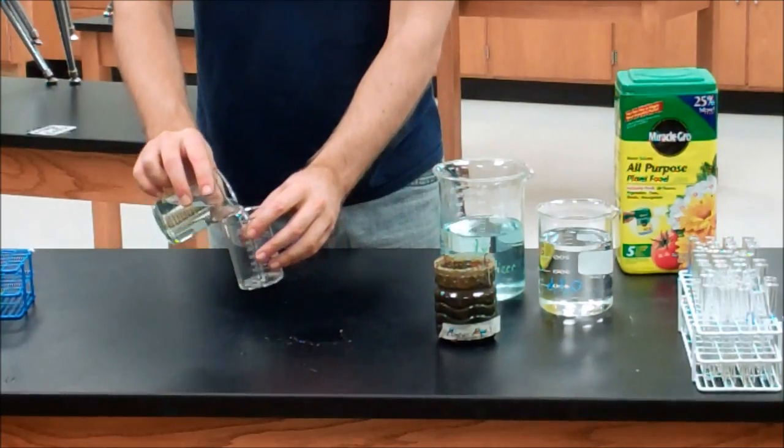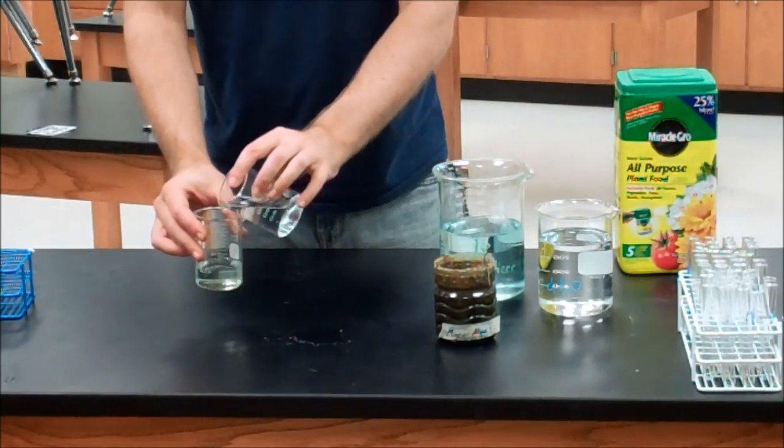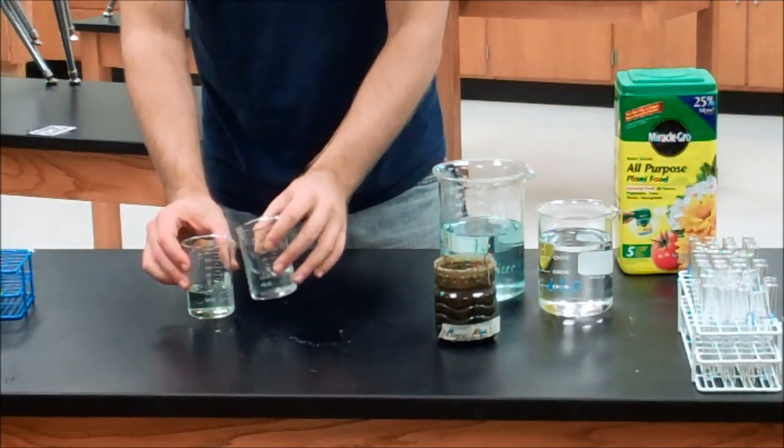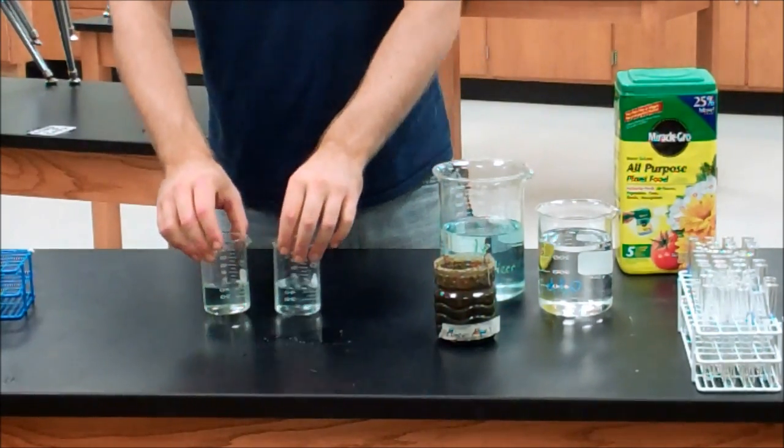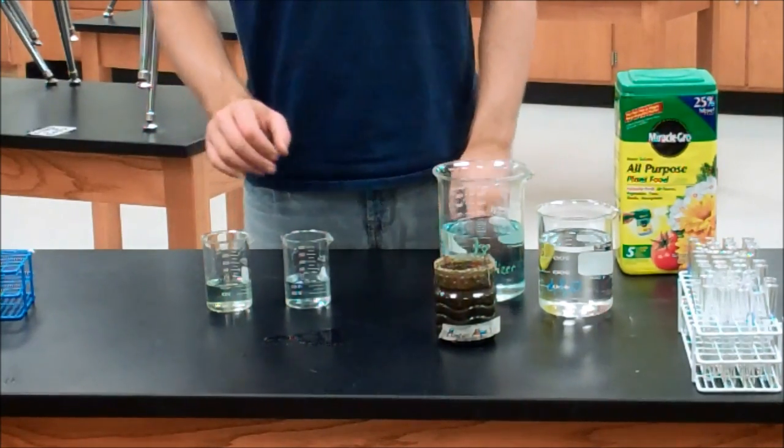And from here we're going to cut it in half. So whenever our two volumes look to be pretty close to equal we now have exactly half the original volume of our original concentration.